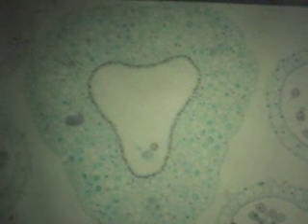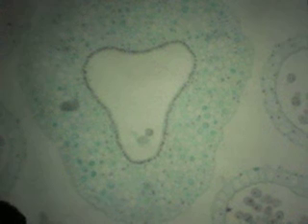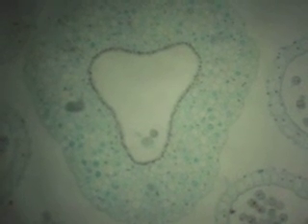Number 7, like I said, is a lily flower, and we're running a little short, so just 1 flower bud for every 2 people. The lily flowers are in this preservative. They are huge, okay? Don't need a microscope. Just pull it out with your bare hand, put it on a piece of paper, and open it up. You'll see 6 stamens, you'll see a pistil. The pistil is about 3 to 3.5 inches big. So it's huge.